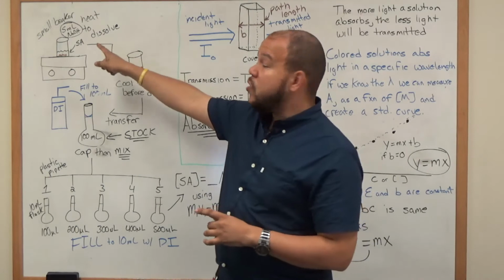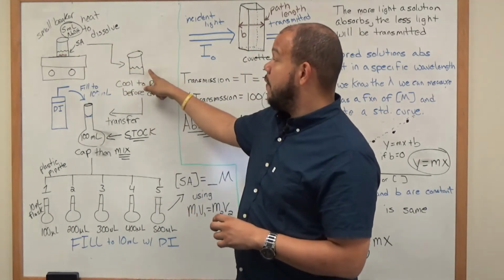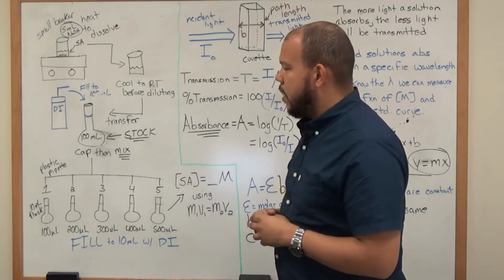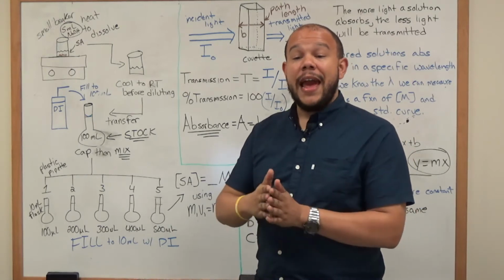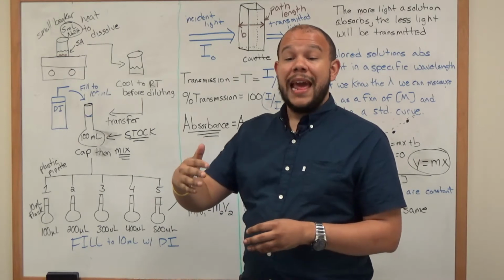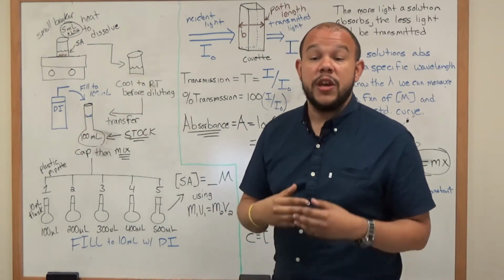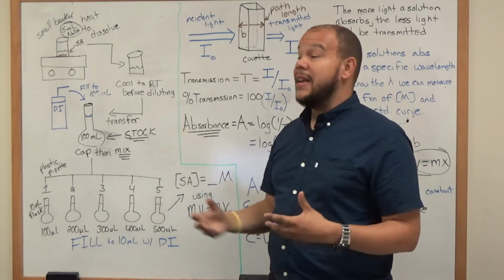Because we know the total amount of solid that was put into the solution and we know the volume of the total solution, we can now know the total molarity. Now, what we're doing from there is we want to create a range of solutions that allow us to determine and measure an absorbance so that we can get a standard curve or a calibration curve. And we can use that curve and that slope to determine any unknown using any of these same chemicals.